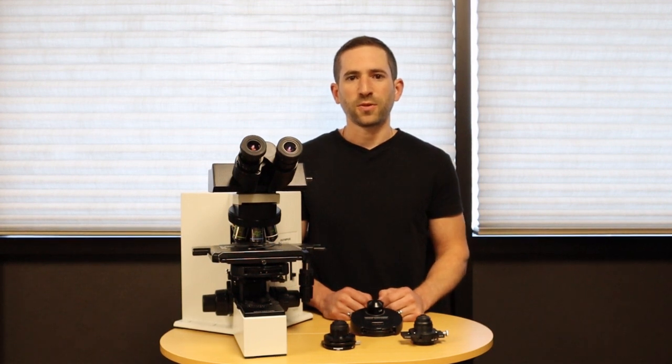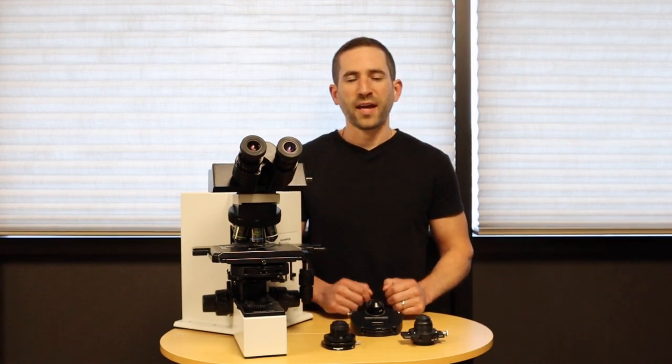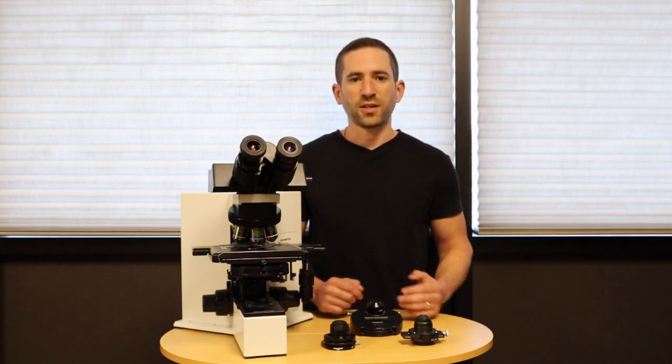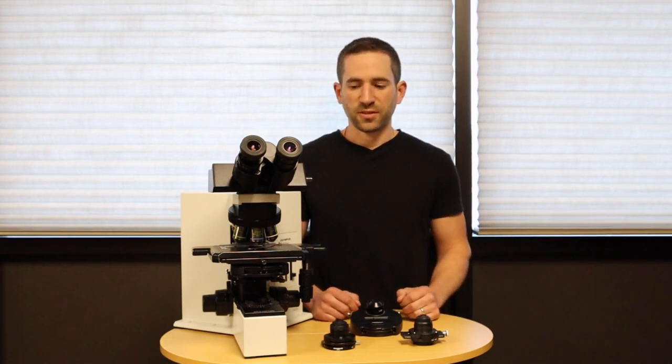If you're looking for a microscope for your wastewater treatment facility, you're going to want to look for a phase contrast microscope. While a bright field microscope can work, it might be hard to identify the organisms. With a phase contrast microscope, it gives you contrast to easily identify your organisms.